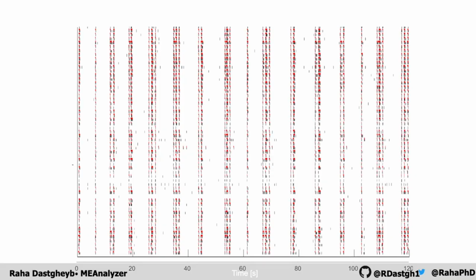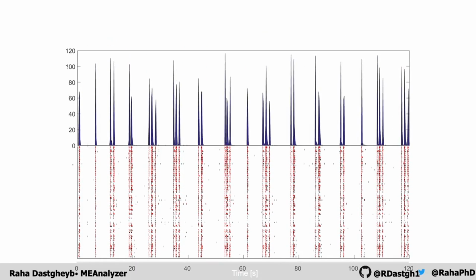The good thing is that we have all the data and we can analyze it and represent it any way we want. But still, every step of the way, we need to be very clear about our assumptions. So here we can sum the electrodes in 0.2 second bins and get an idea of the spike activity over time for the whole plate. In making this binned plot, I've made an assumption about the temporal resolution I think is important. If I change that and I have 1 second bins instead, this graph will look completely different. It doesn't mean that one of these is right and one is wrong, it just means that the design is completely fluid based on my assumptions. And based on our ability to make observations, I think that this activity on this plate looks periodic. So we can move on to analyzing that.